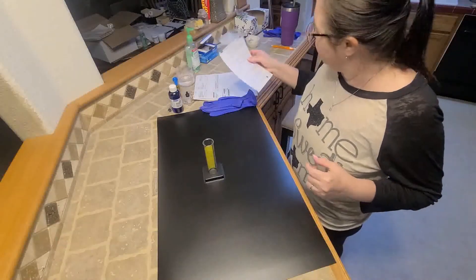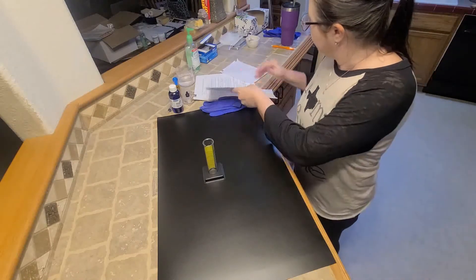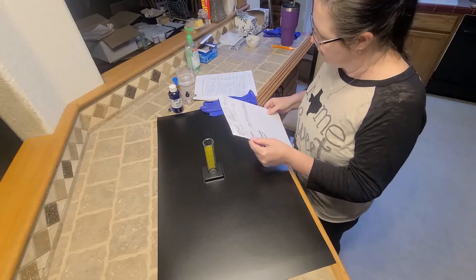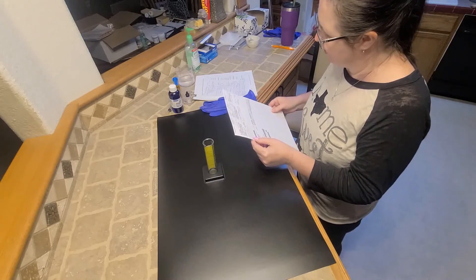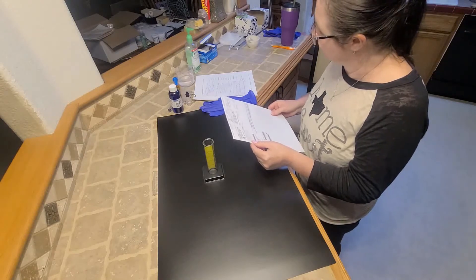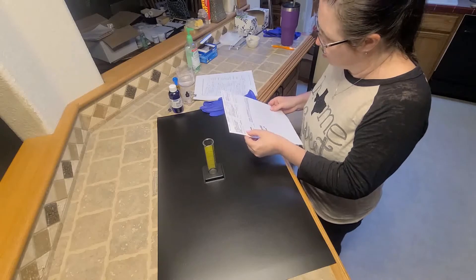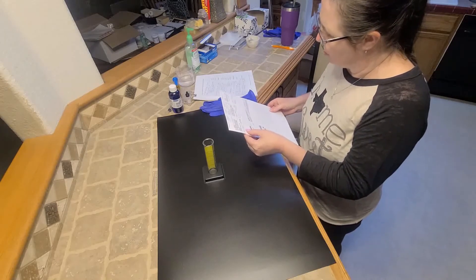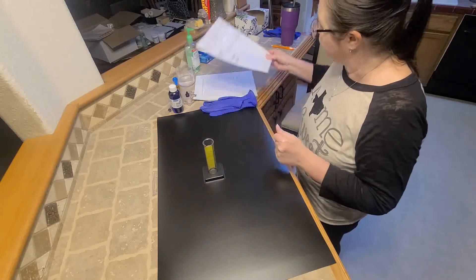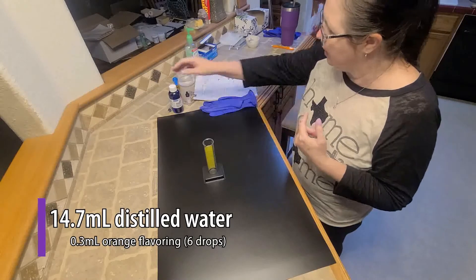Today I am going to be reconstituting a pediatric suspension. Our patient's name is Adele Wilson, a three-year-old. This is a five-day supply of azithromycin 200 milligrams per 5 milliliters suspension. The prescription date is 10/22/2019, so our beyond-use date (BUD) is going to be November 1st, 2019.